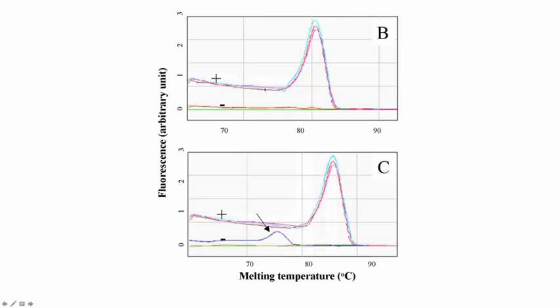And as you increase the temperature at a certain point with SYBR Green, all of a sudden the DNA is going to become single-stranded again. And as the DNA becomes single-stranded with SYBR Green, now the fluorescent molecule leaves the double-stranded DNA and it's no longer fluorescing. So you see a big change in fluorescence. So this graph is change in fluorescence right here.